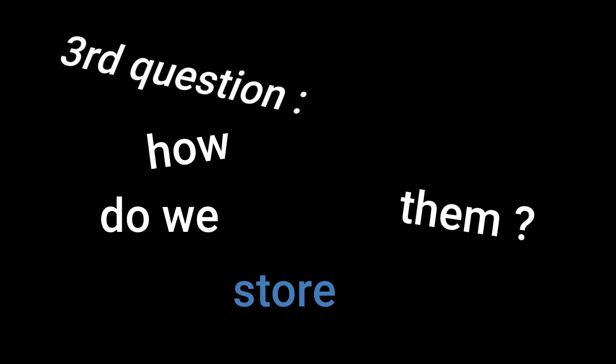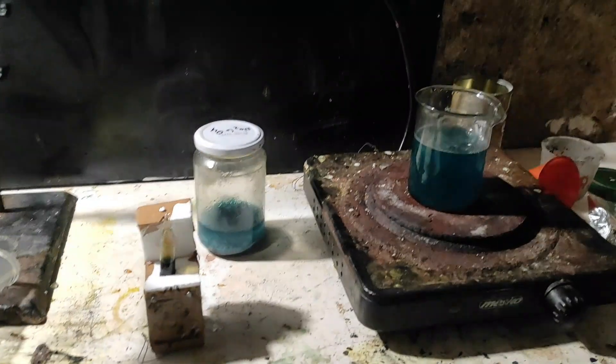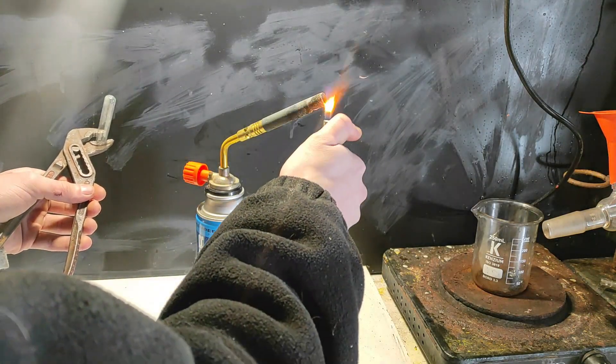Third and final question: how do we store them? Because they are gases at normal temperatures, we need to store them in an ampoule. What this does is that, even though the temperature will go higher than the boiling point of the nitrogen oxides, the ampoule will pressurize the gases so that they always stay liquid. Now, before doing the reaction, we need to prepare the ampoule in advance.